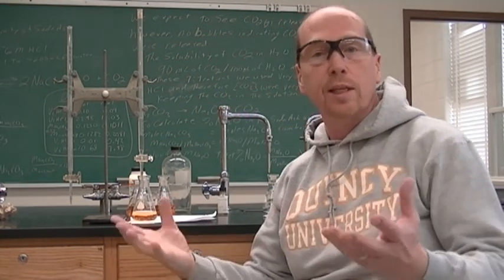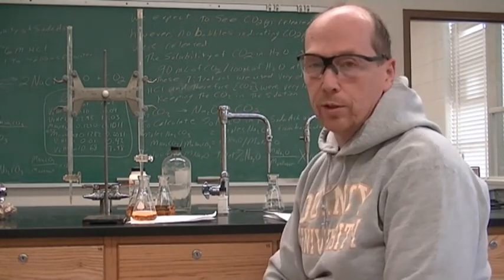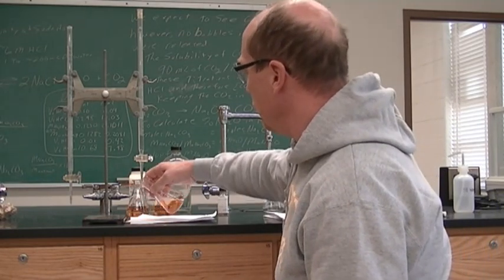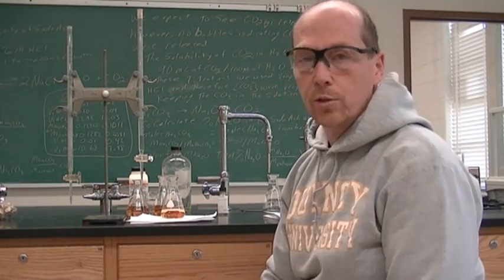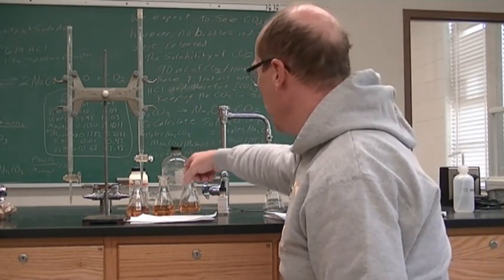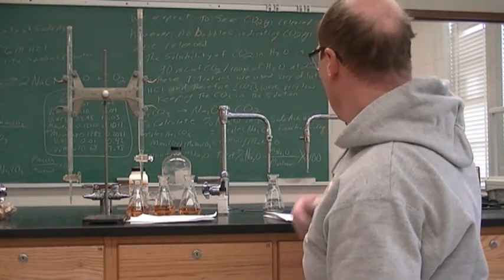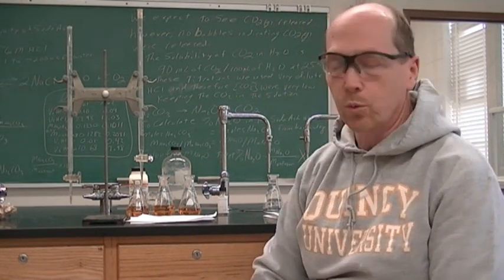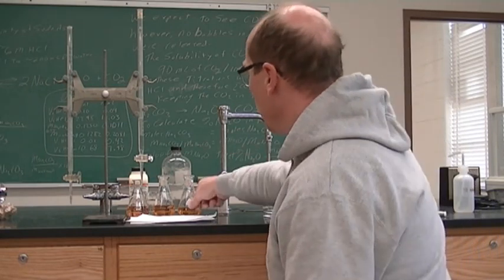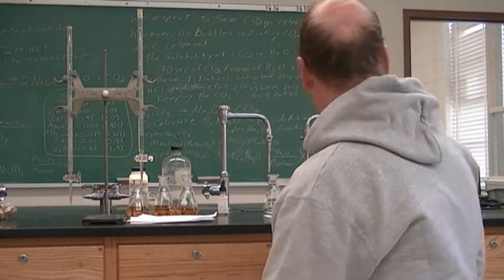All right, so it's insignificant. So the water is perfect. And so we don't have to worry about the deionized water. So there's no calculations that we're going to do with the blank. It is just to make sure that our water is good. All right, and so our two numbers are 20.59 and 20.61. It was like 1 drop is all required to get it to that color.